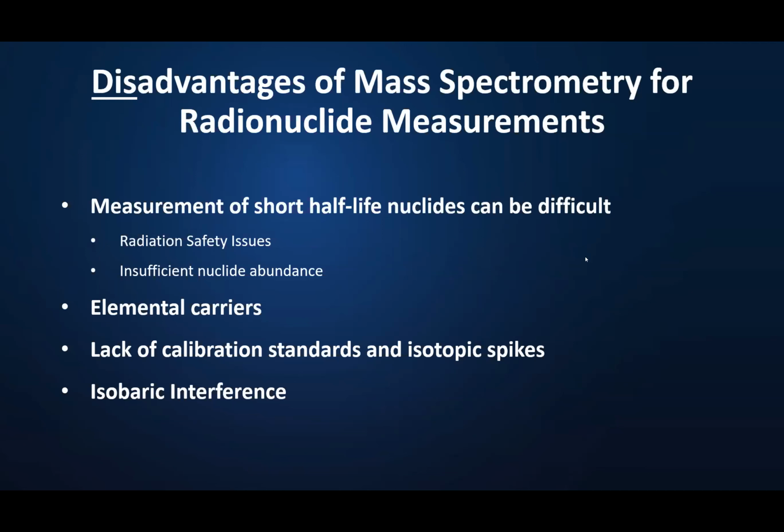I'm just going to pipe in. This is Jackie. Richard's bang on right, and we've heard from many customers for years: why can't you assign isotopic values to the spectrometric solutions? The challenge is that a lot of the current spectrometric solutions were not made for that community. So we really would have to start from scratch to create a suite of spectrometric solutions specifically for the isotopic community. Otherwise, we could end up selling out of everything and then there's nothing left for everybody. So we have to be careful with that. Wow, sounds like an excellent role for a SURF student over the summer to get that started.